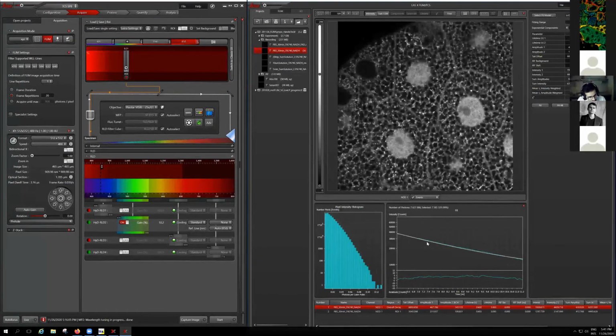So I see a tiny deviation from the measured data, where in the whole field of view I have something like 25,000 counts, and we are talking about a deviation of 12. That's true, it is said that we have to search for a chi-square of about 1, but not limited to that. So it's not the only parameter.